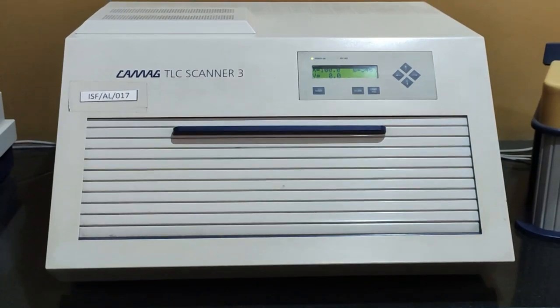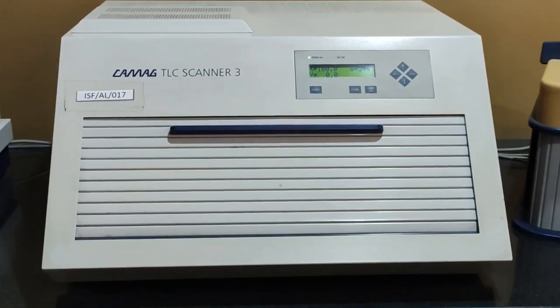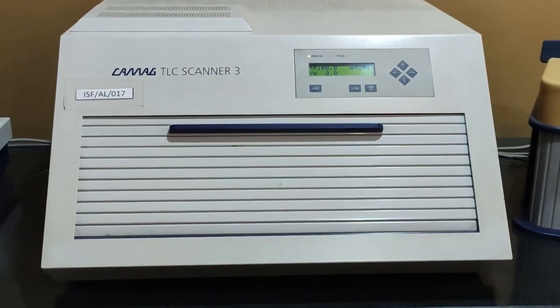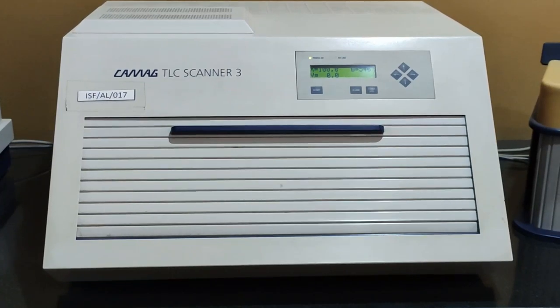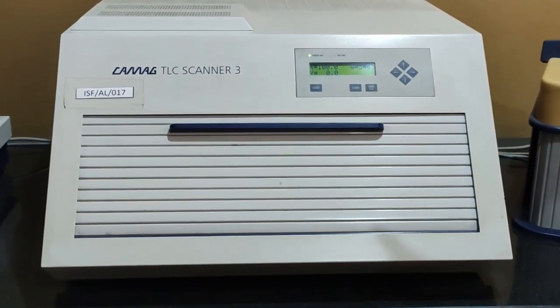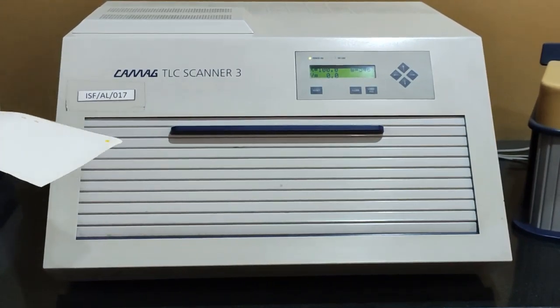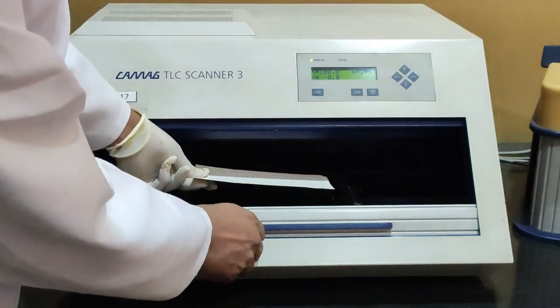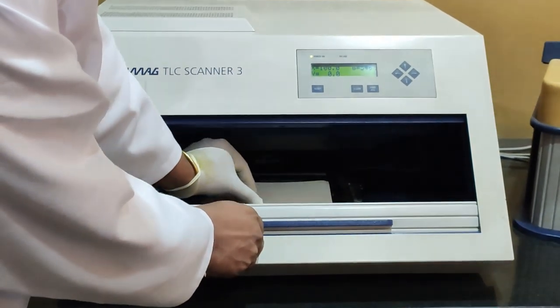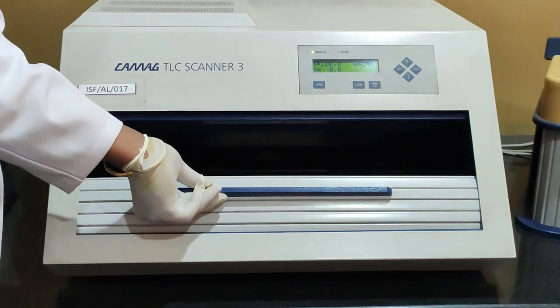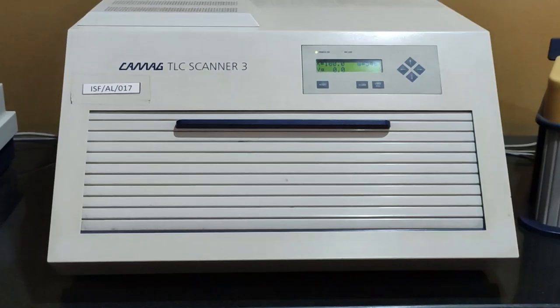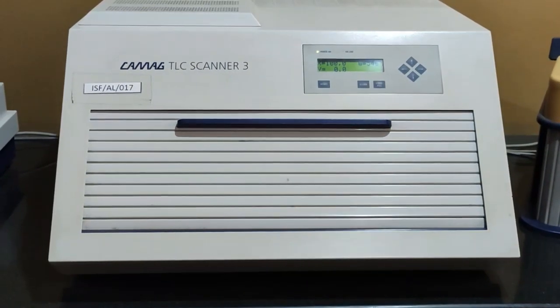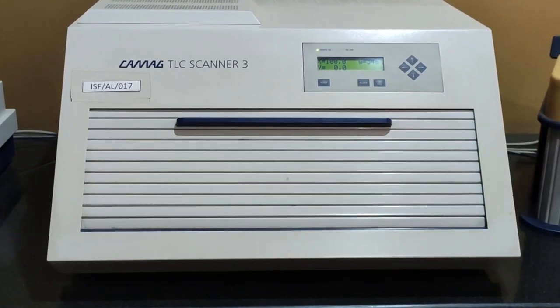Up to this we have done the qualitative analysis. But if you want to go for quantitative analysis, we have to go for the TLC scanner. So this is the Camag TLC scanner. So this is the way how we are going to put the plate inside and close it properly. In this TLC scanner we can determine the amount of the compound present in the sample by comparing with the standard.